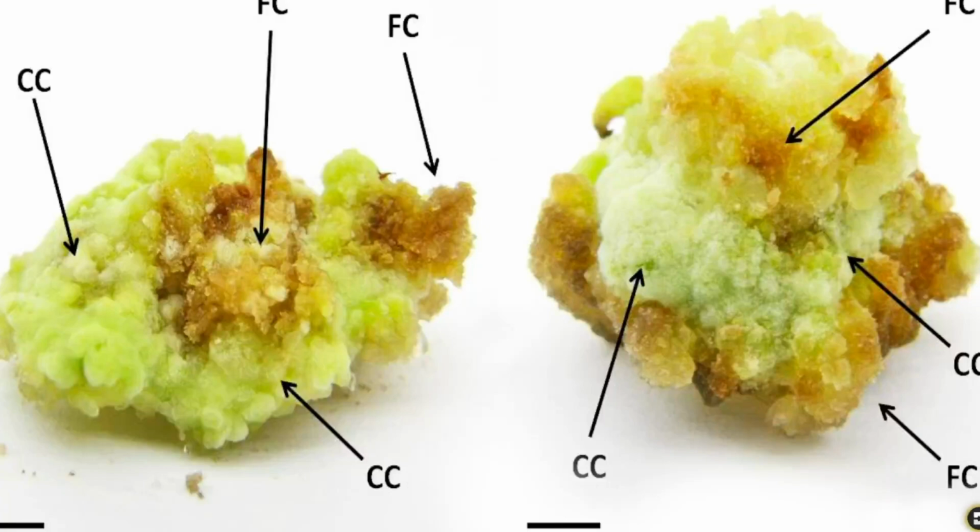And this should give you a great representation of which parts of the callus material are which. Now, yes, you can use and you will use both types of callus material. However, when you go to separate this and flask it up or put it into a plate or put it into a jar, it is best to note which you're using, whether it be compact or friable, and keep those notes in your research for future use.